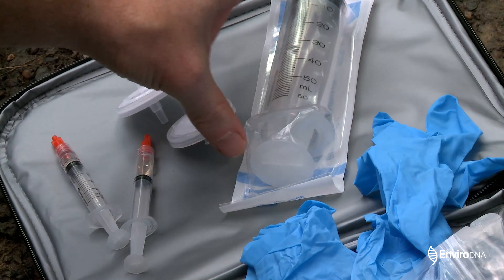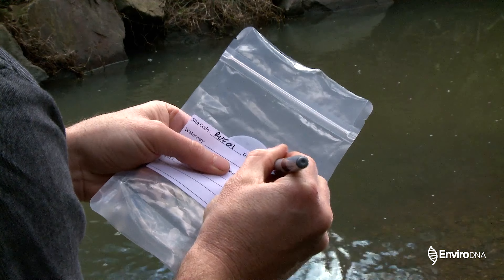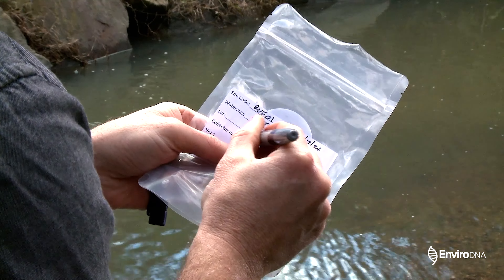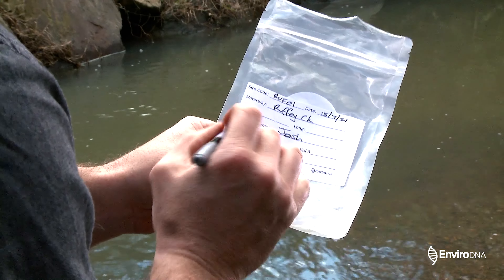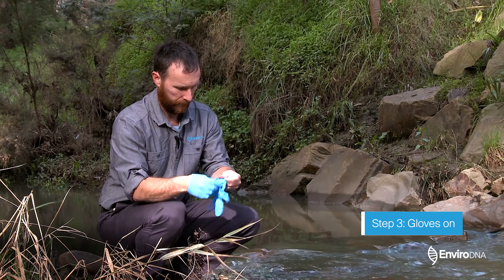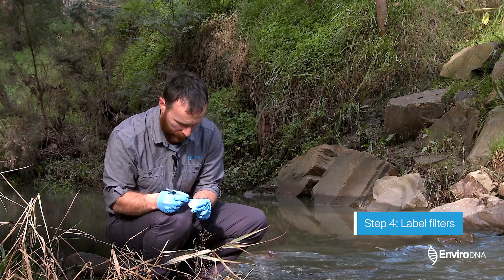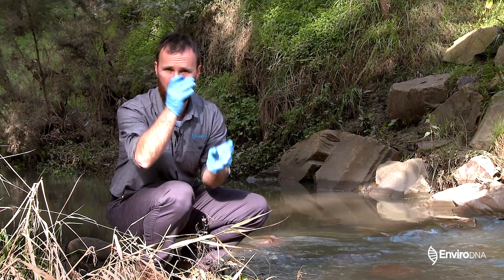You'll have a site code that will be provided to you, so please make sure you're recording that site code precisely, because we need to know where these samples have come from, the date you're taking the sample, the name of the waterway if you know it, and then just your name so we can get in contact if needed. First I'll get the gloves on, and because we've got two filters I want to label them — one and two — making them nice and obvious and easily readable for the lab team.